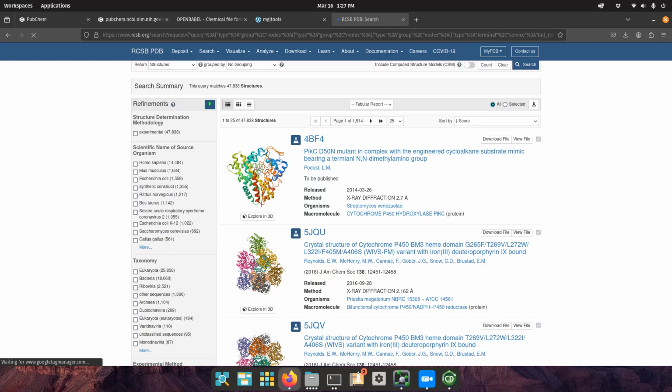Only the sequence information is available, and I had the AlphaFold algorithm, kind of an AI algorithm, fold that sequence based on the homology to known structures. But if you want to know how to do that, that's its own thing. I'd be happy to show you how to do it, but that's another adventure of its own.